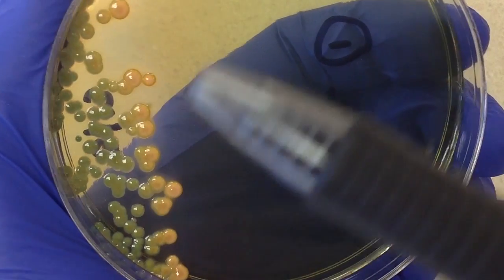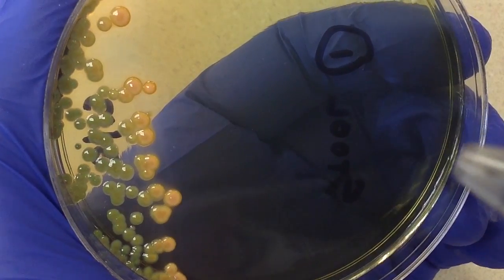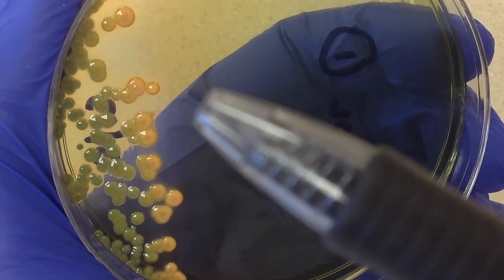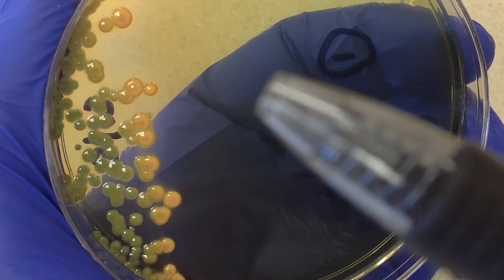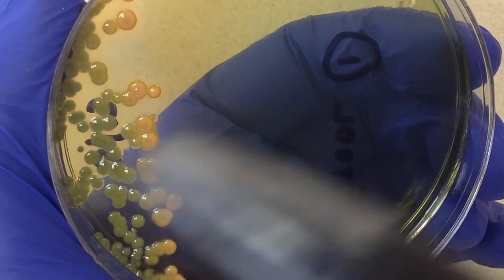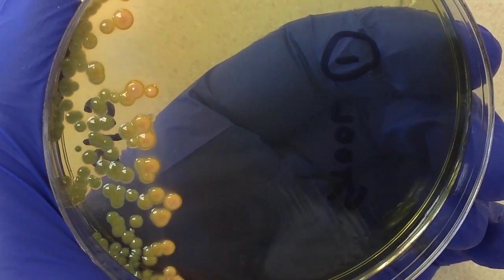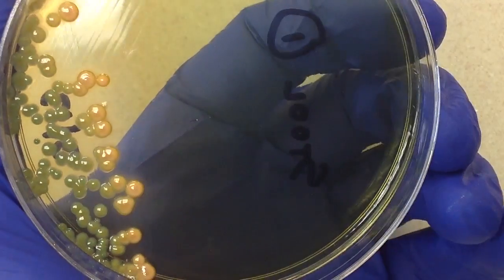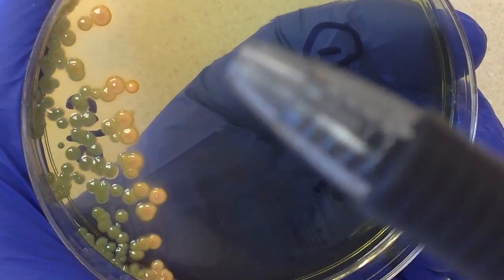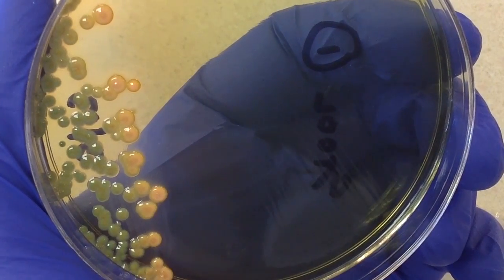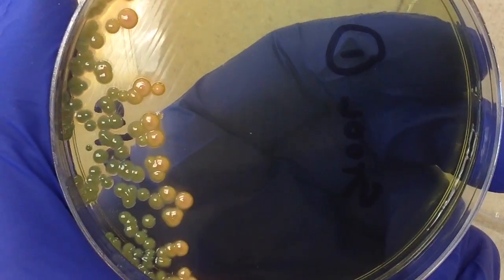For some reason in the inoculation process, we didn't get any colonies coming out here. But I can see here that these colonies here are kind of this yellowish color, and therefore lactose positive. In the back here, we have ones that are kind of the same color, they're kind of greenish. But like I said before, the longer a culture sits on the plate, or the longer the culture is incubated, bacteria sit on the plate, probably all of these were this yellowish color and they tend to revert back. I don't see anything on this plate that is of concern to me.